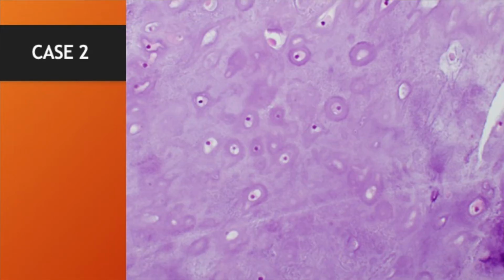Here is a very hypocellular lesion with just a couple of cells and lots of purple in the background. So we have a blue/purple thing. And in comparison to the previous one, there's almost no white space here. There's a little bit, especially inside the cells, but overall, the previous one is a good demonstration of what a lot of blank space looks like under a photomicrograph.